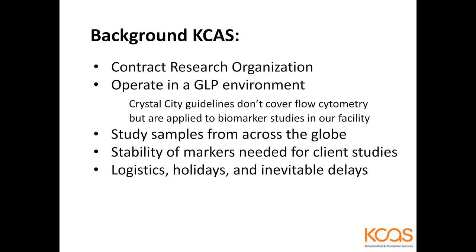So first, KCAS has been in business for about 37 years doing pharmacodynamic and pharmacokinetic studies. It's a contract research organization, meaning we run these experiments or studies for our clients who are by and large pharmaceutical companies. And biosimilars and biomarkers have recently jumped to the forefront of pharmacological product development. So things like antibodies are now being used as drugs, which means we are doing more studies on biomarkers now than just the drug and its metabolites.